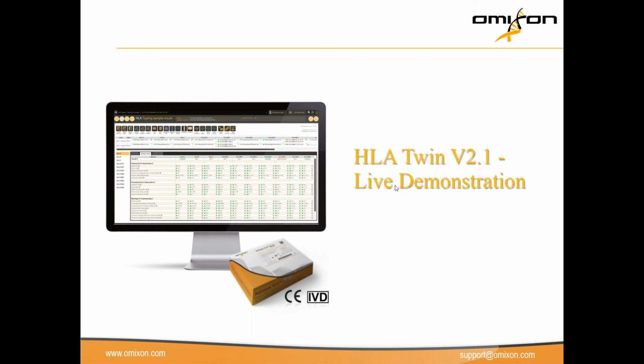And just to add to what Marcello just mentioned, we have already worked with these robots, and we do have scripts for them. But we are happy to work with any liquid handling vendor, to collaborate with them to actually develop the method for the particular robot, if that's what is available in the lab. So Tecan is also included in that.